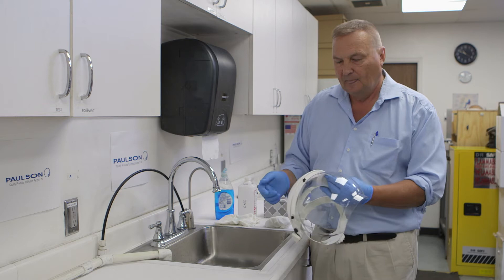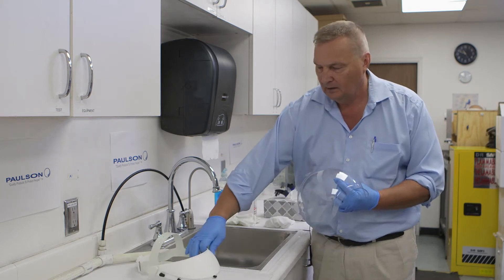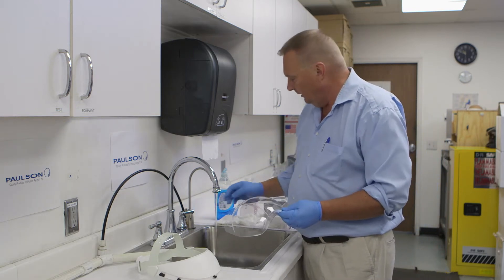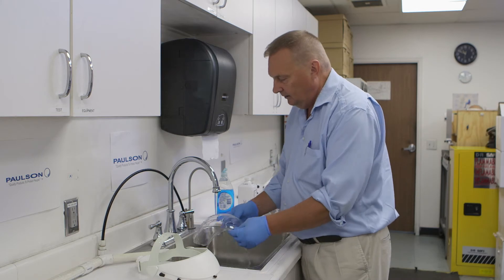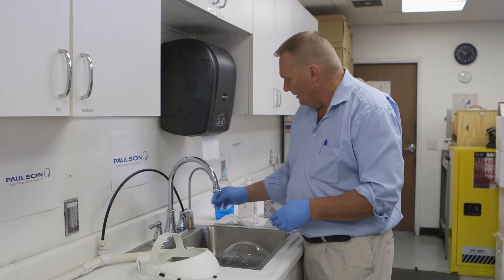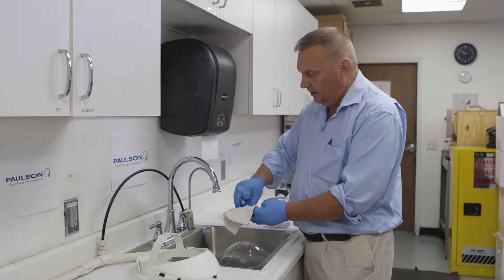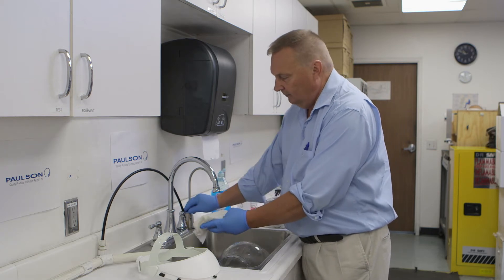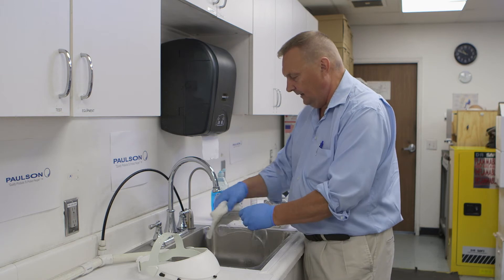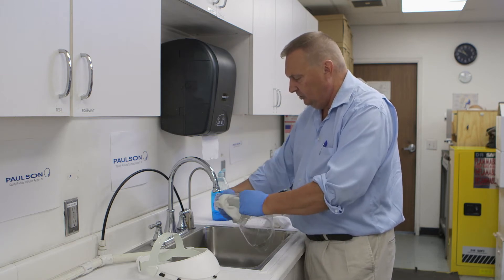First, remove the face shield from the headgear so we treat them as two separate subjects. Under running water, rinse the product and get any large debris off of it. Then take a soft cotton rag, put a small amount of dish detergent on it, wet the rag, and gently go over the product. Remove all debris, making sure you get along all of the edges.